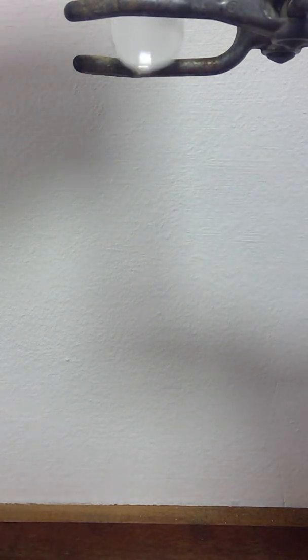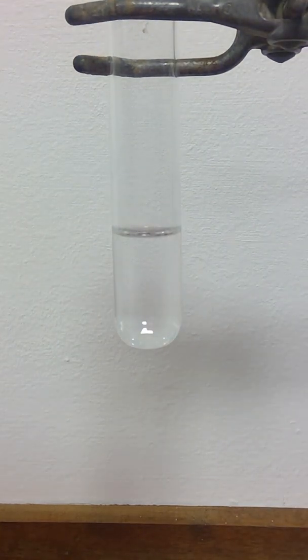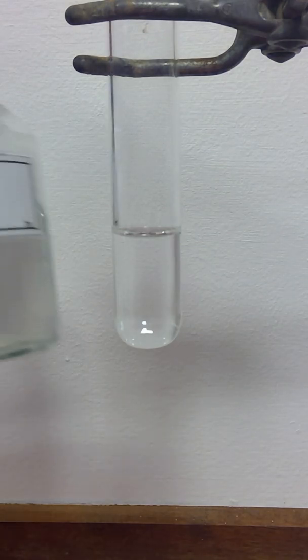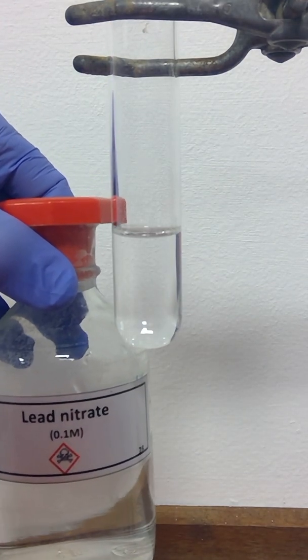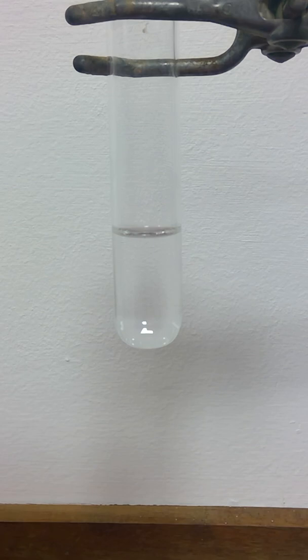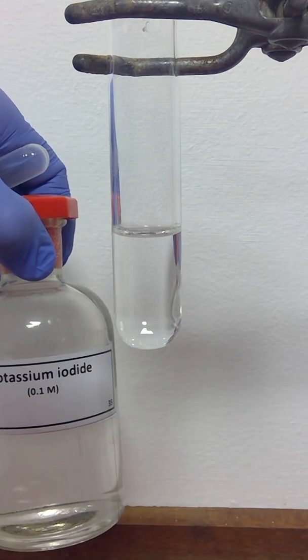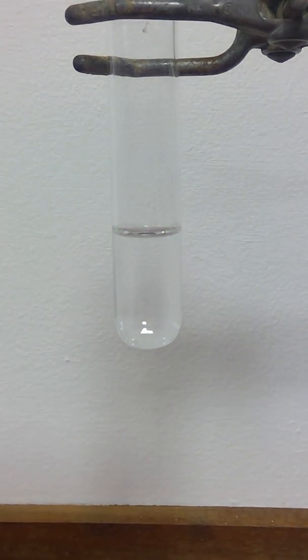In the second example, we're going to take lead nitrate solution. In this case, we're going to precipitate a salt. Lead nitrate, again, has been made by dissolving a white solid, lead nitrate, into water. The solution that is going to be added this time is potassium iodide solution, also near colourless. So watch again as a few drops of potassium iodide are added to the lead nitrate.